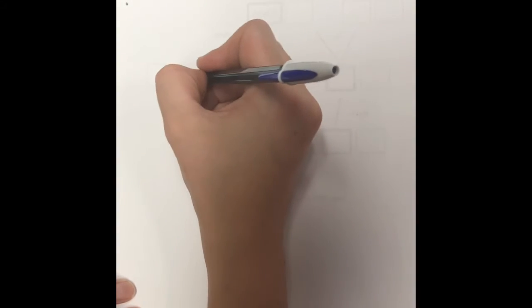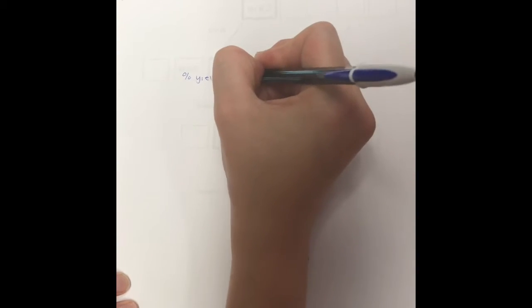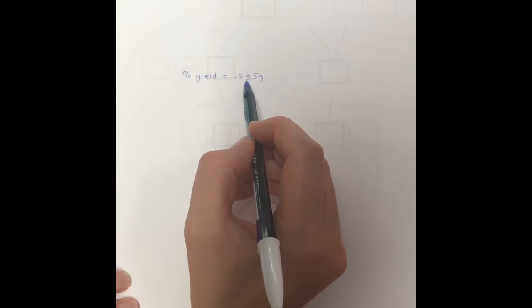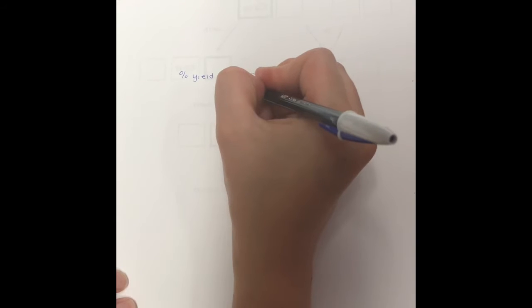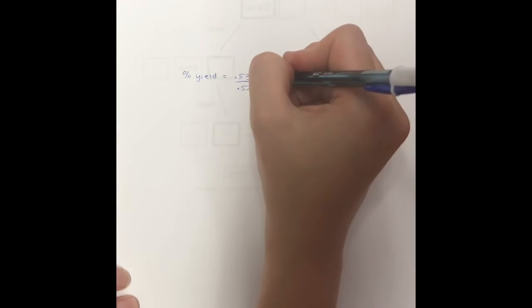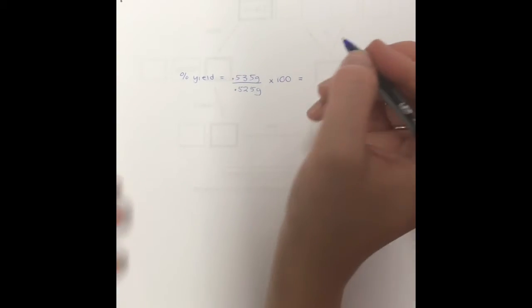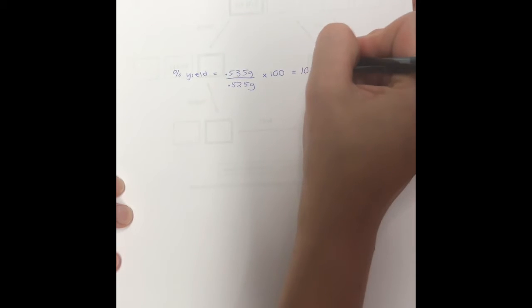To find the percent yield, I calculated the recovered mass of the Cu and divided it by the initial mass of Cu and multiplied by 100. This is the value of the recovered mass of Cu. And this is the initial mass of the Cu. My final percent yield was 101.904%.